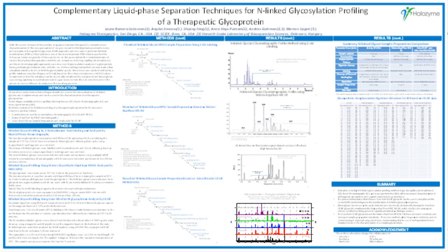So it looks like we do have a couple of questions. We'll go ahead and get started with these, Laura. The first is, how many samples can you analyze using the SCIEX Fast Glycan Kit? So the kit is intended to analyze up to 100 samples.